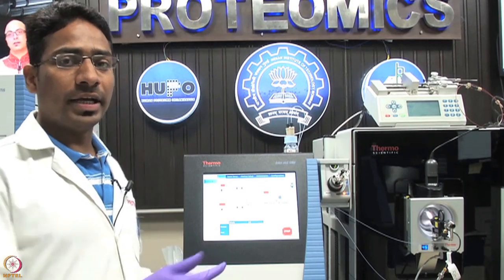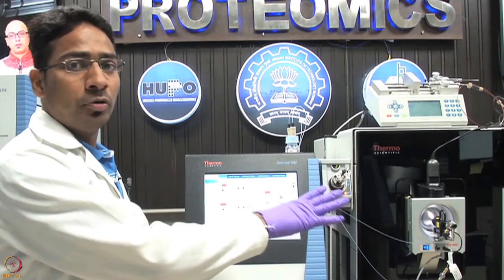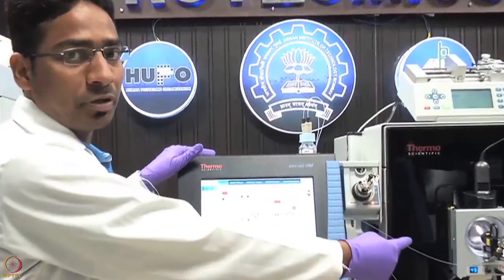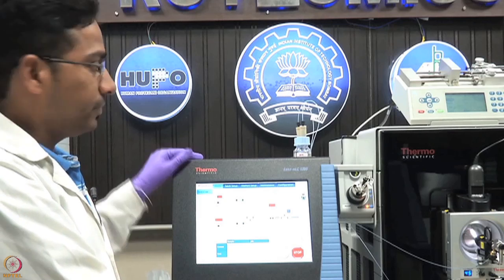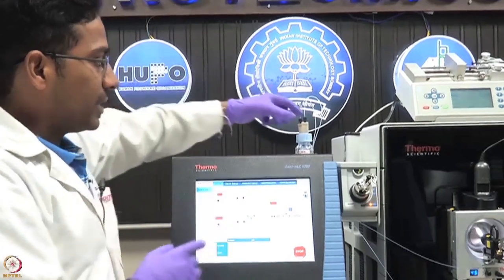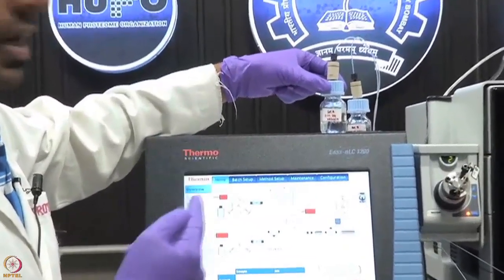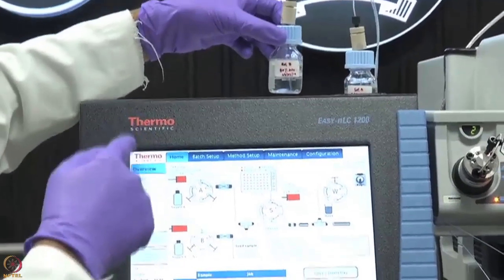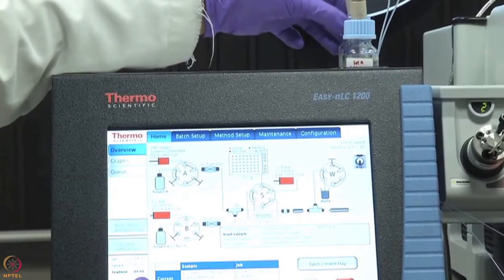Hello, so here I am going to explain about mass spectrometry. Basically there are two main components: one is liquid chromatography, another is mass spectrometry. I am going to explain first about liquid chromatography. Here you can see there are two main solvents: solvent A, which has 0.1% formic acid, and solvent B, which is 80% ACN in 0.1% formic acid.